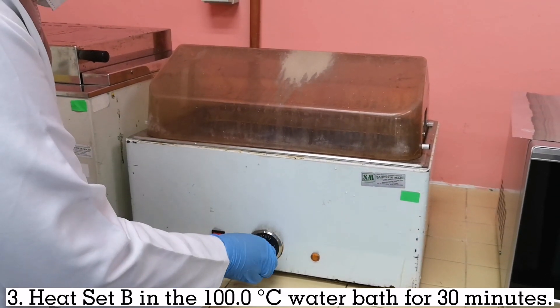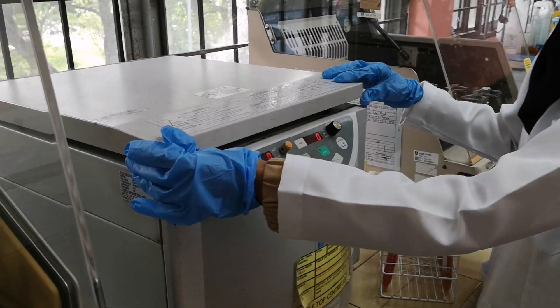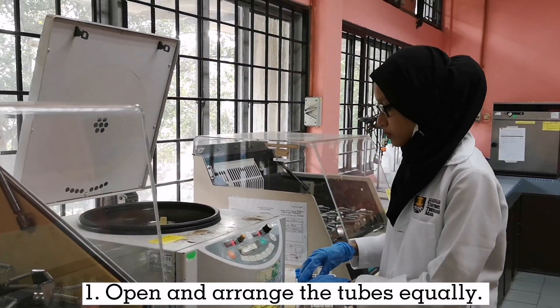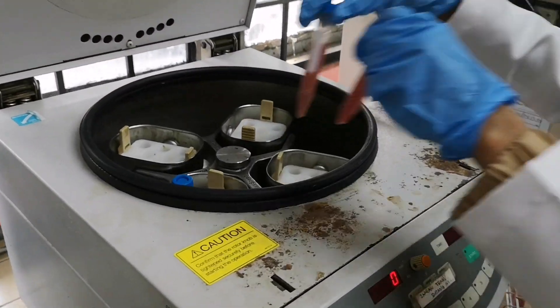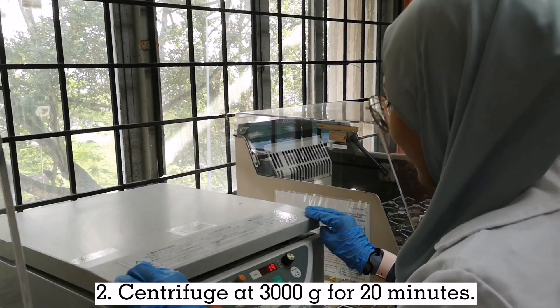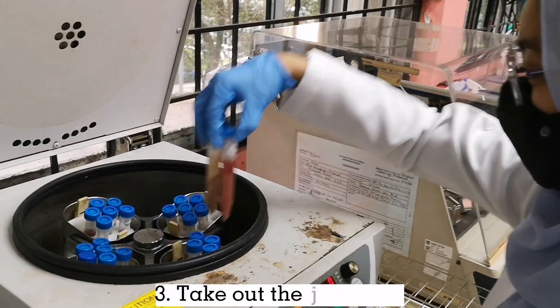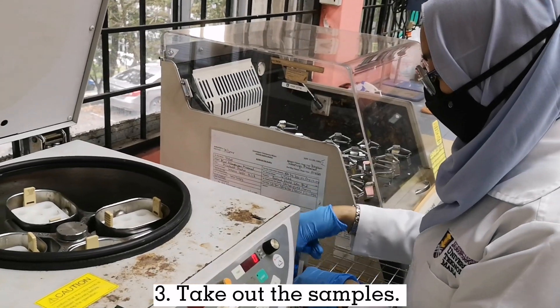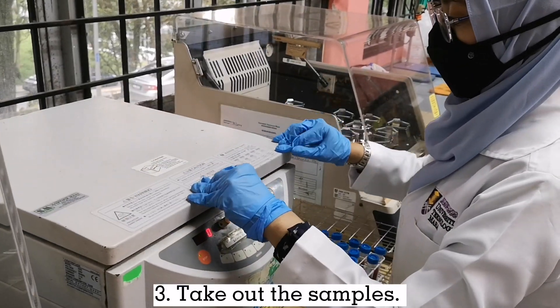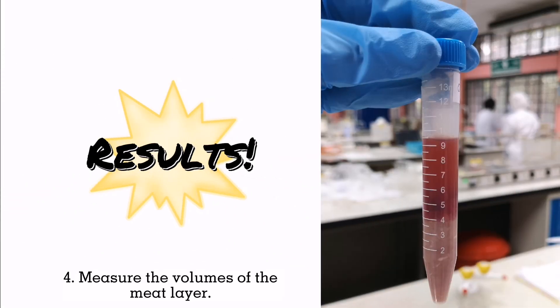Heat set B in a 100 degree Celsius water bath for 30 minutes. Open and arrange the tubes equally. Centrifuge at 3000g for 20 minutes. Take out the samples. Measure the volume of the meat layer.